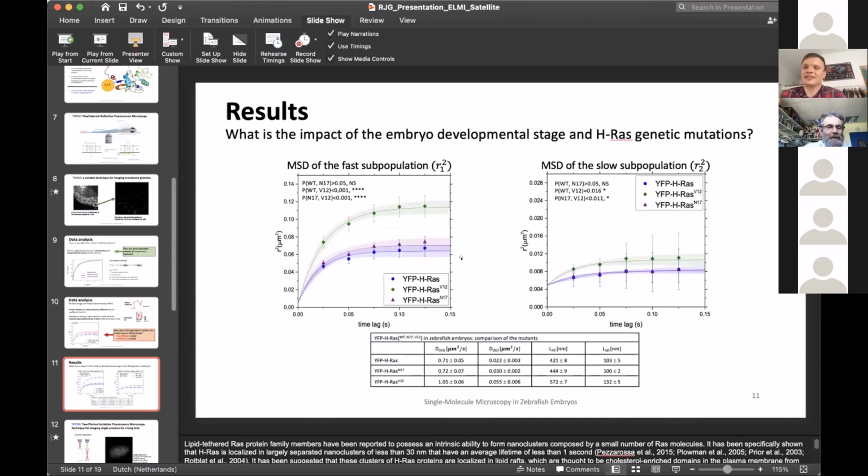Yeah, that is of course possible. I also aimed at some point to do, for example, a double stain of the molecule and actin. We haven't done it yet, but that's definitely something that would really enrich our knowledge on that.